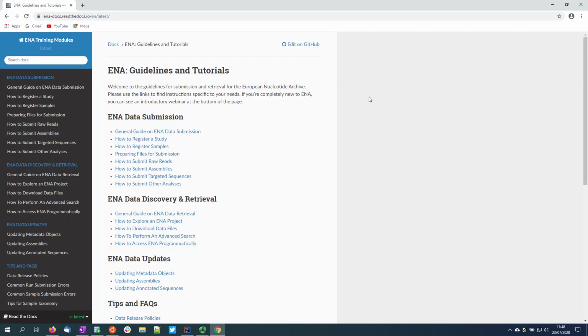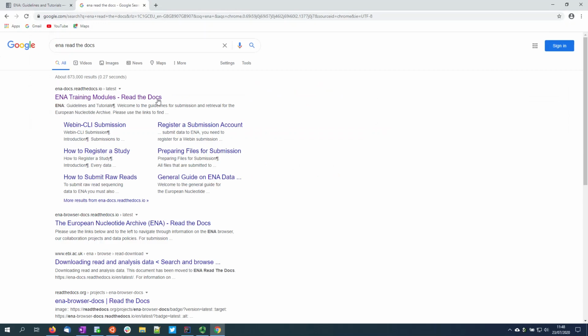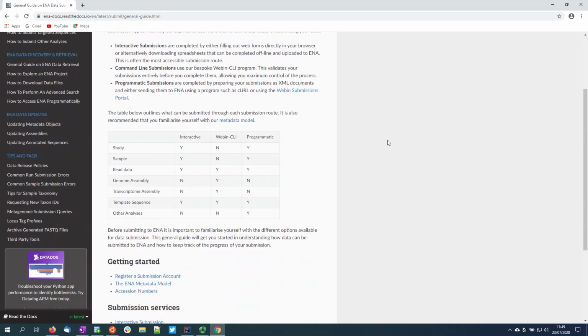So we're going to start from the ENA Read the Docs pages. If you're watching this video, you're probably already familiar with this, but if not, you can just Google something like ENA Read the Docs, and it should be the first thing that comes up. Once you get here, click on the General Guide to ENA Data Submission, and this is where you can start to get an introduction on how to submit data to ENA.